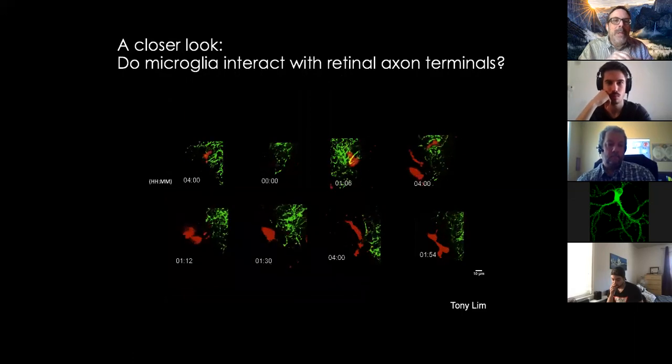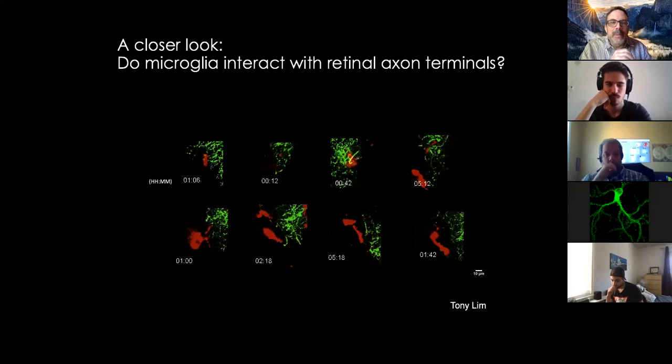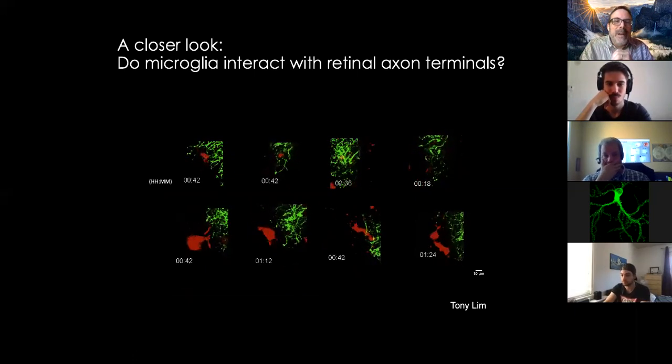And we can actually go in and find individual cases where the microglia are interacting directly with the axons. And this is pretty cool because if you were to just image the axons without seeing the microglia, you would see these occasional movements of the tissue, and you might think that that's just artifact, you know, the blood flow or an unstable image.